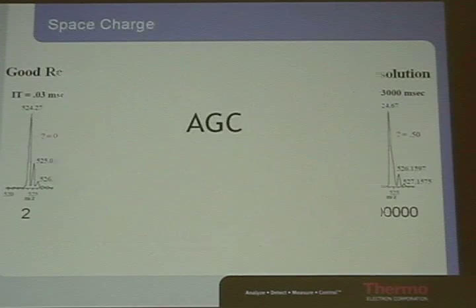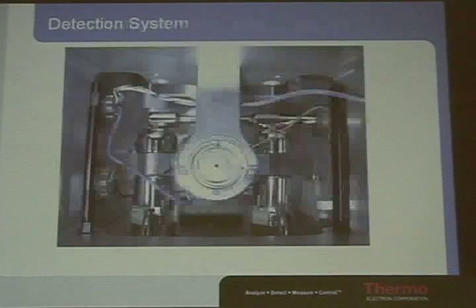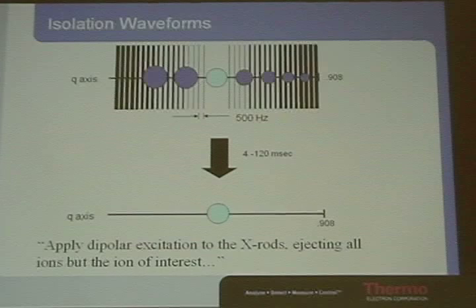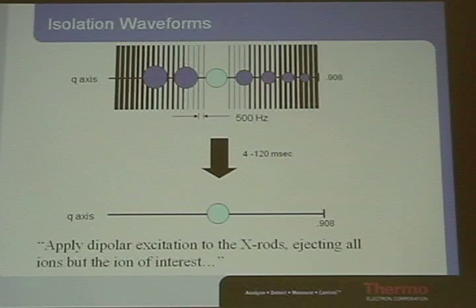So you can stuff more ions in the FTICR. We're going to talk about those injection times a little later. Are those numbers directly comparable? Is that physically the number of ions, truly the number of ions? In the linear trap, yes. In the FT, no. It's an estimation of some sort. I'll give you some rough numbers when we get there.